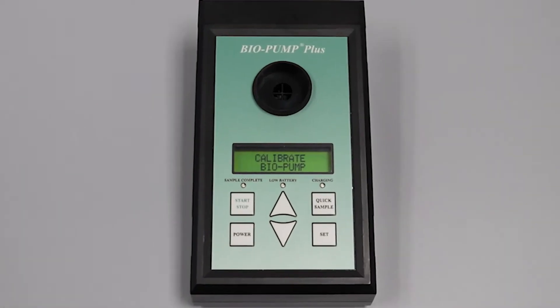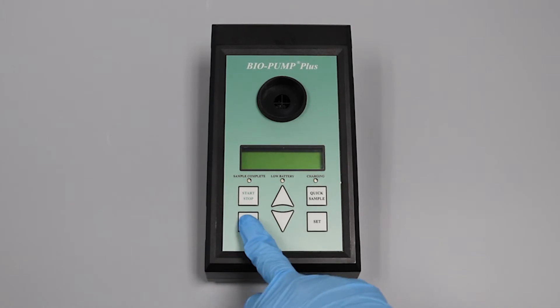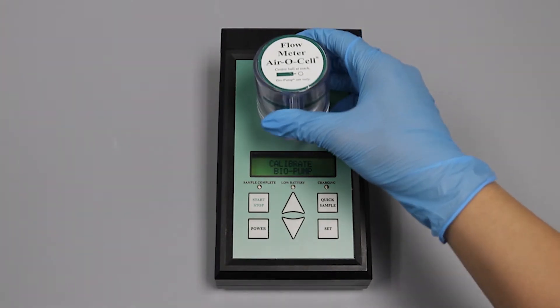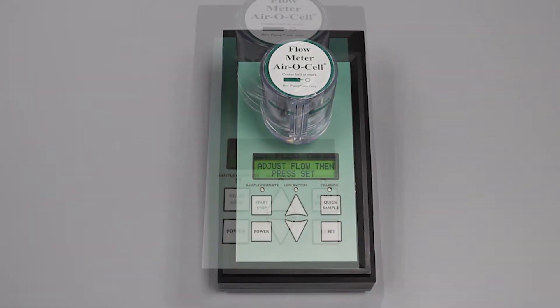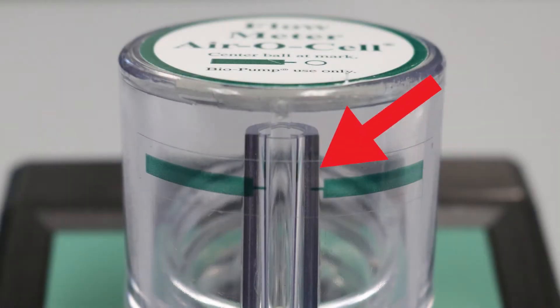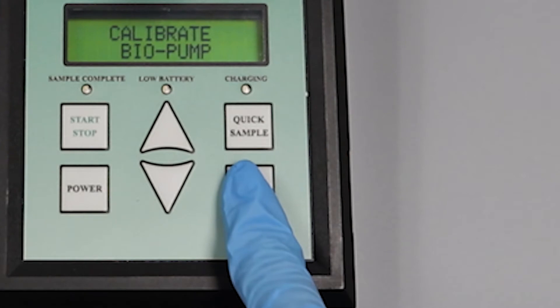The pump should be calibrated prior to each sampling event. To calibrate, press the power button and use the arrow keys to scroll and select calibrate bio pump. Attach the flow indicator vertically. Press the set button, then adjust the flow rate using the up and down arrow keys to position the ball at the 15 lpm line. When the position is achieved, press the set button again to finish calibration.